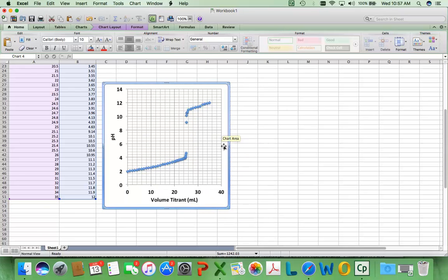Another thing to stress when you're making these plots: not only do you want your axes labels and associated units, but it's also a really nice thing to make sure that the data points show up on your plot, and that the aspect ratio of your plot is approximately 1:1, which means it appears square. So this XY coordinate system is square.